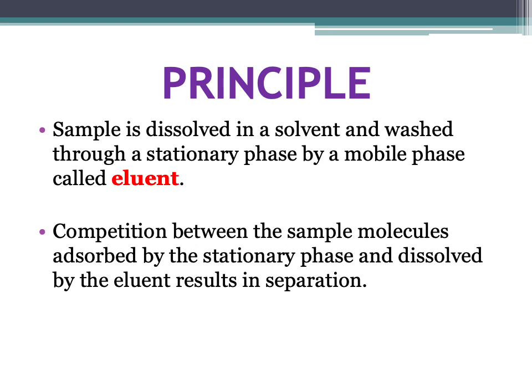So macam mana berlaku separation tu? Okay, because of the competition between the sample molecule. So contohnya kita ada mixture, dia adalah combination daripada molekul-molekul yang ada. Contohnya saya ada satu mixture. Mixture ni adalah saya lakukan dari satu reaction. Dia adalah mixture daripada benzaldehyde, styrene, styrene oxide. Okay, so saya nak separatekan antara benzaldehyde, styrene dengan styrene oxide tu. Okay, so saya akan buat chromatography. So dia akan lalu stationary phase dengan menggunakan mobile phase. So ada competition antara molekul-molekul tu. So dia boleh separate.